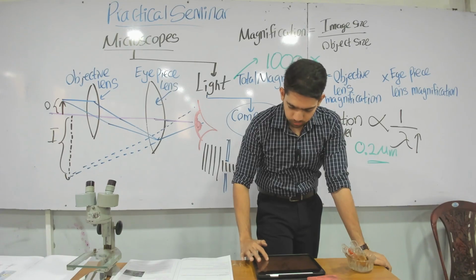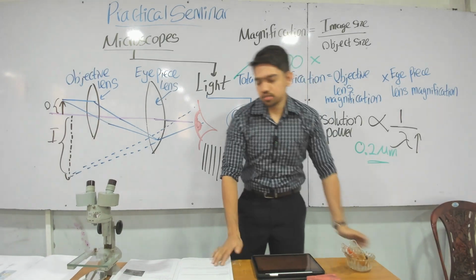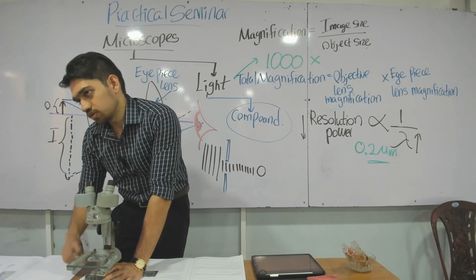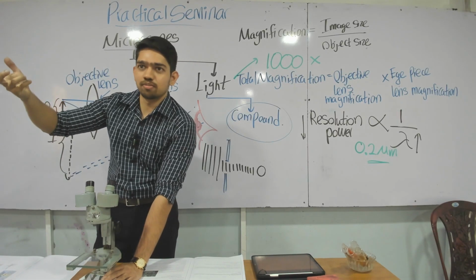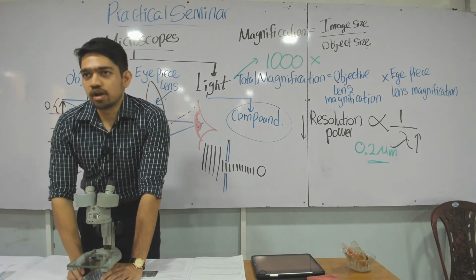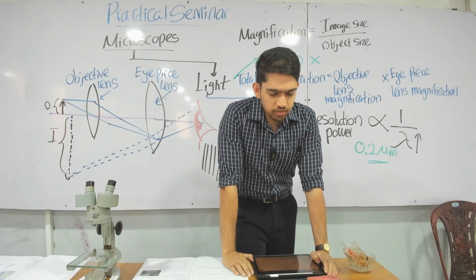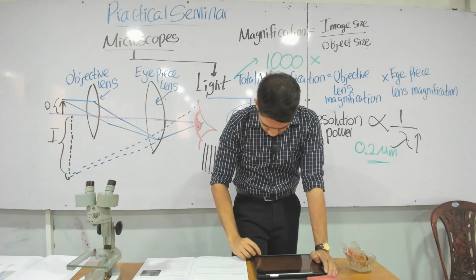Light intensity knob. I can't show you that here. If you have a sort of a bulb illuminated light source, there's a switch on this side that you can turn to decrease the brightness. Have you had that in your house, where you can decrease and increase the brightness? Certain LED lamps, I think you still can, right? So you can control the illumination using the light intensity knob. It adjusts the light intensity.